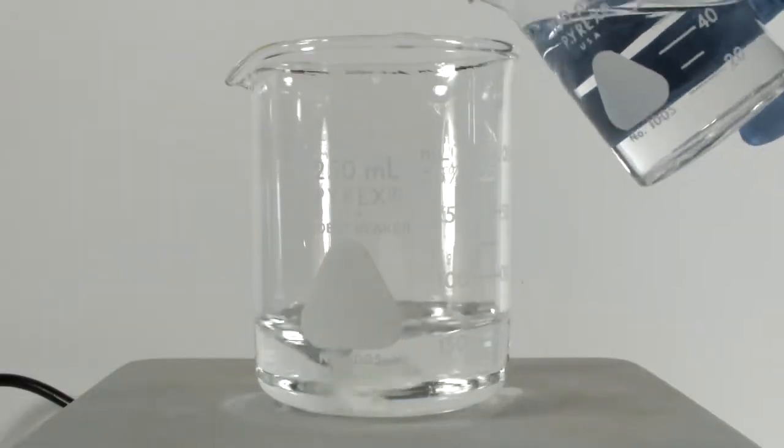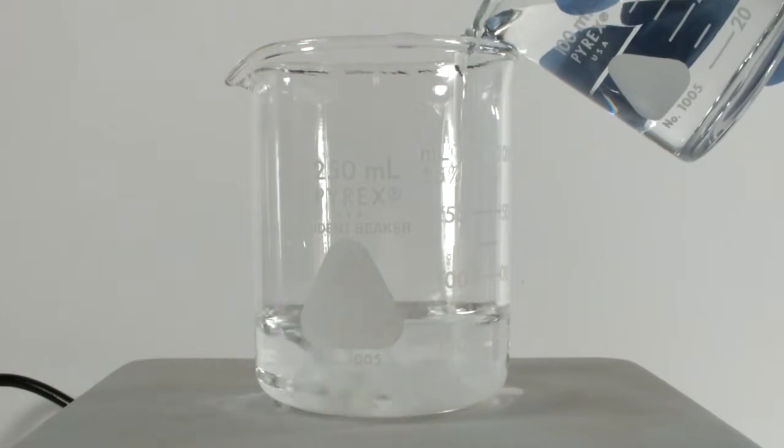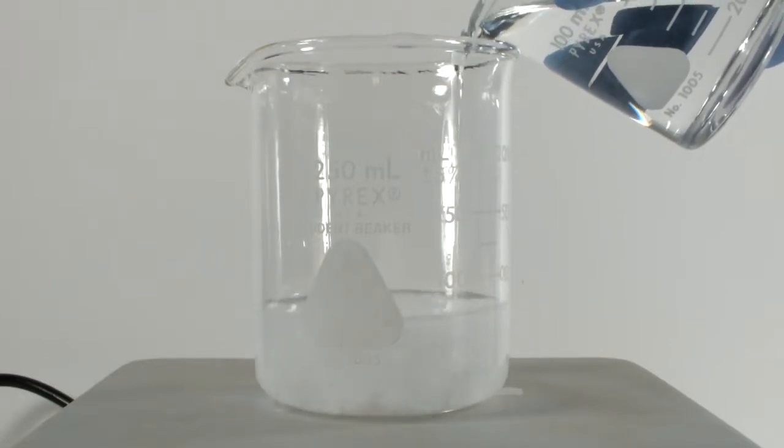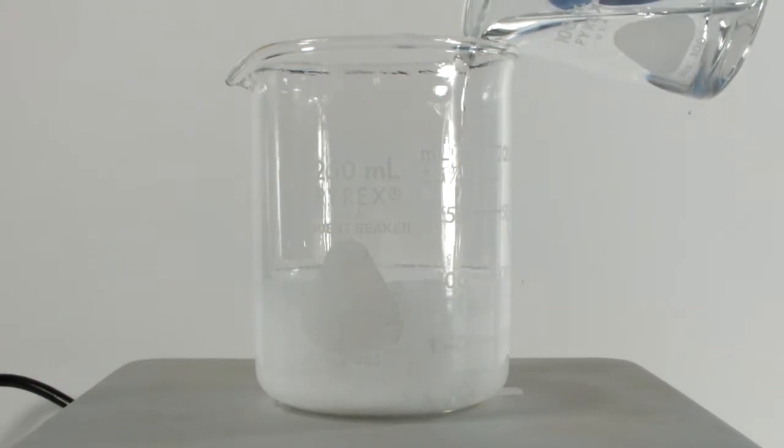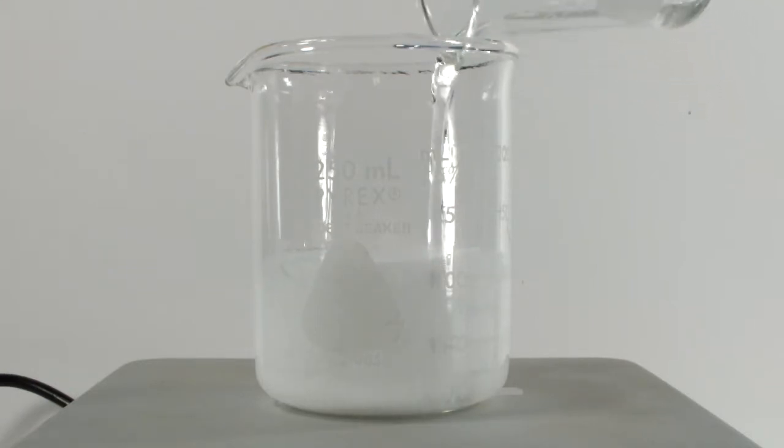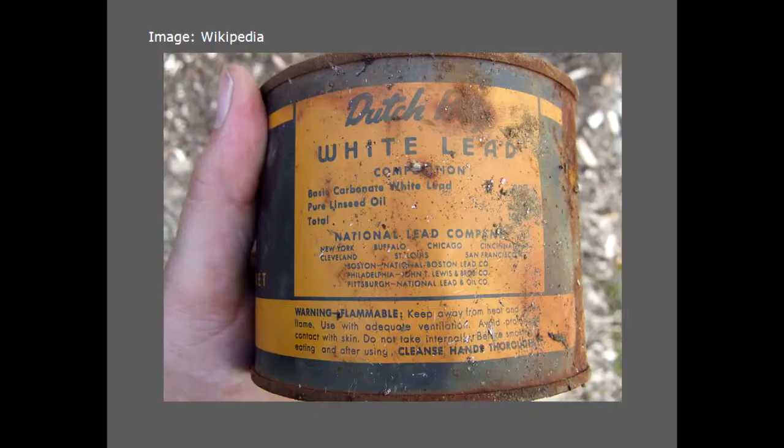Next up is the lead compound that gave lead paint its name. Here's another 50 milliliters of the 0.5 molar lead nitrate to start, and I'm adding the proper equivalent of a sodium carbonate solution. This will produce basic lead carbonate, also known as white lead. Here's a picture from back in the day when lead in your paint was a selling feature. Oh, how the times have changed.